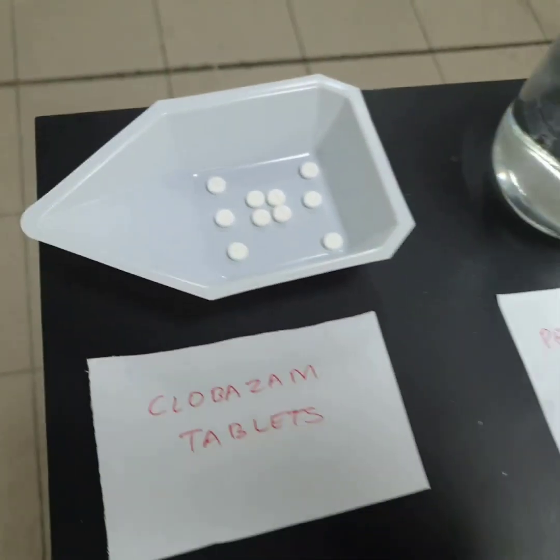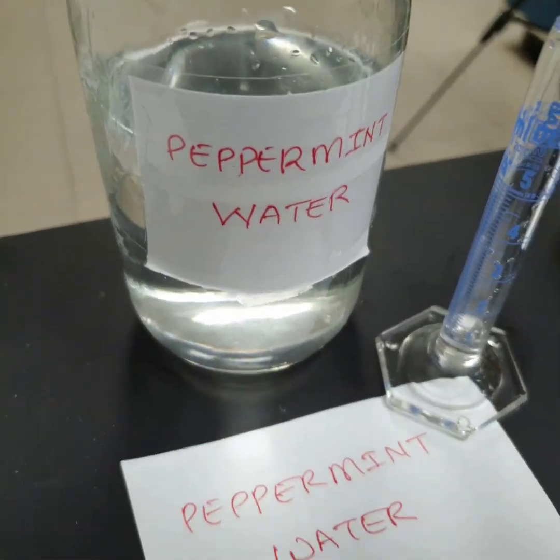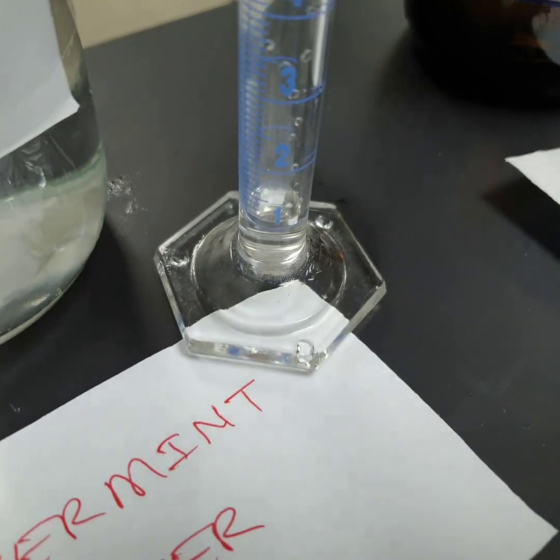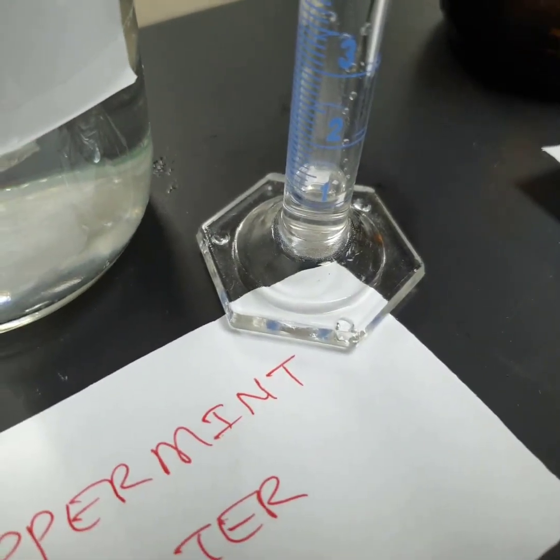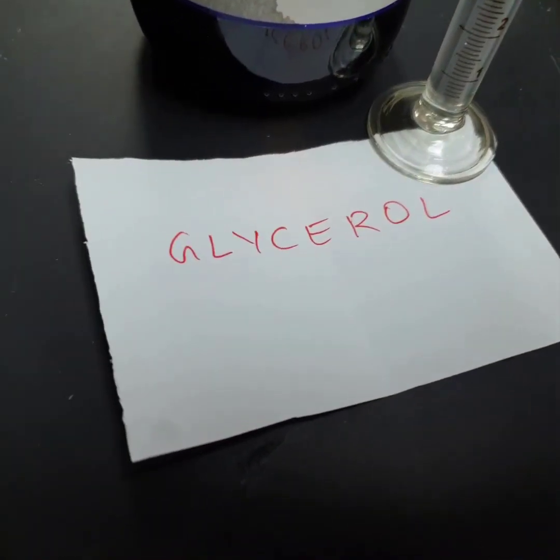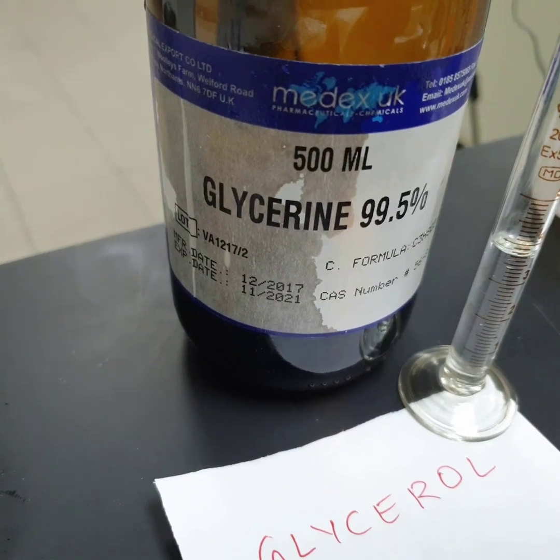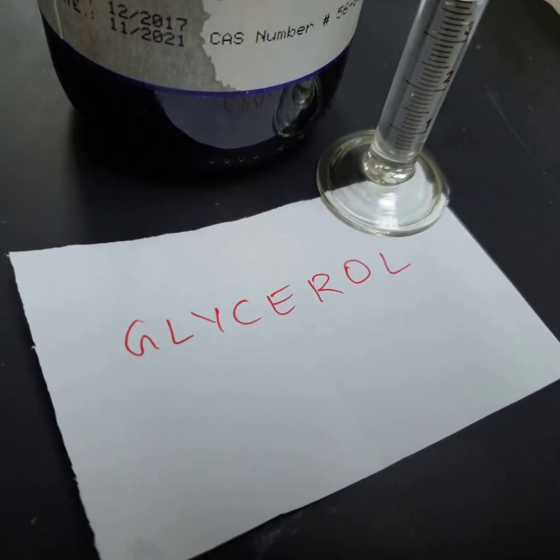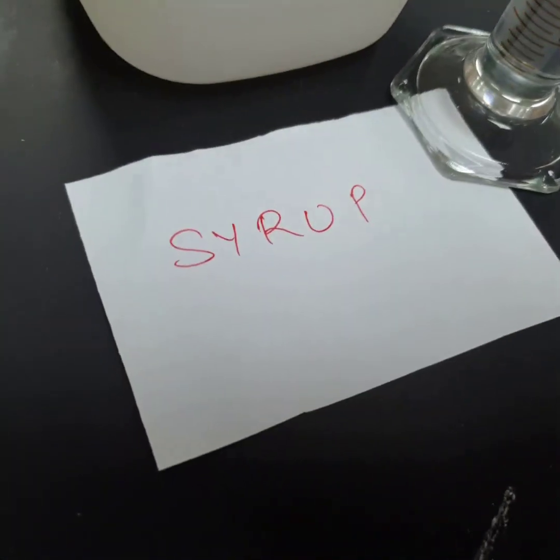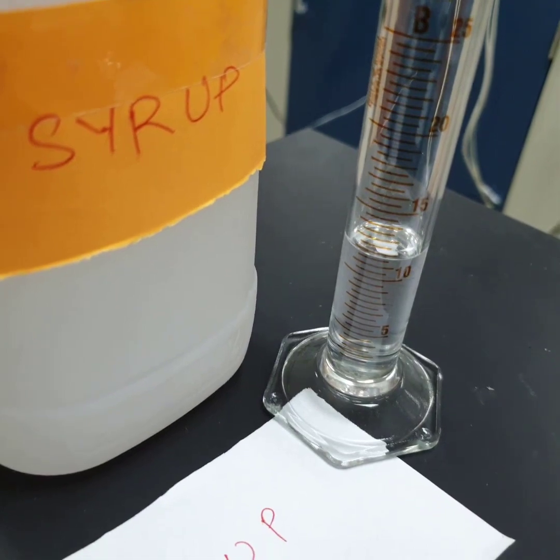The second ingredient which we have in our prescription is peppermint water. This peppermint water is for flavoring agent and we are going to use it as 1 ml only. And then we are going to have glycerol 3 ml, which, glycerol and glycerine is the same thing. And the fourth ingredient, which is syrup, we will be using 12.5 ml.